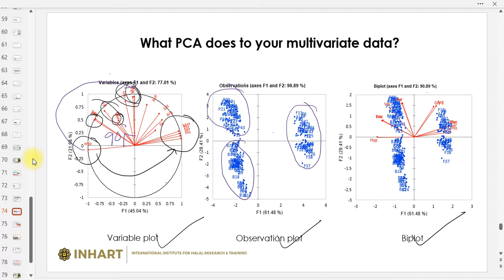So methionine, serine, histidine are characterizing the fish gelatin. They are dominant in this fish gelatin, but the fish gelatin has a low hydroxyproline. Why? Because they are in a negatively proportional vector. They are high in these amino acids, but low in hydroxyproline for fish. Nampak? Faham?